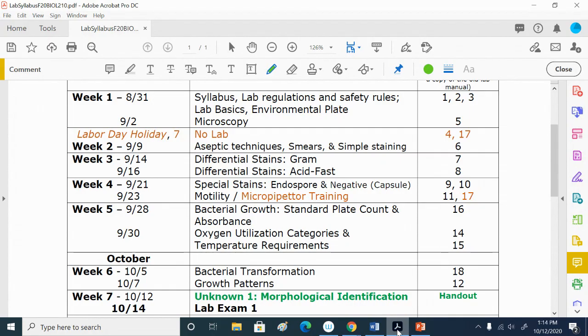where do we find bacteria and other microorganisms? Like, what were all the places that we saw? Or just where do you find bacteria and other microorganisms? One word. Everywhere. Everywhere, right? They're everywhere. So then where can contamination come from?